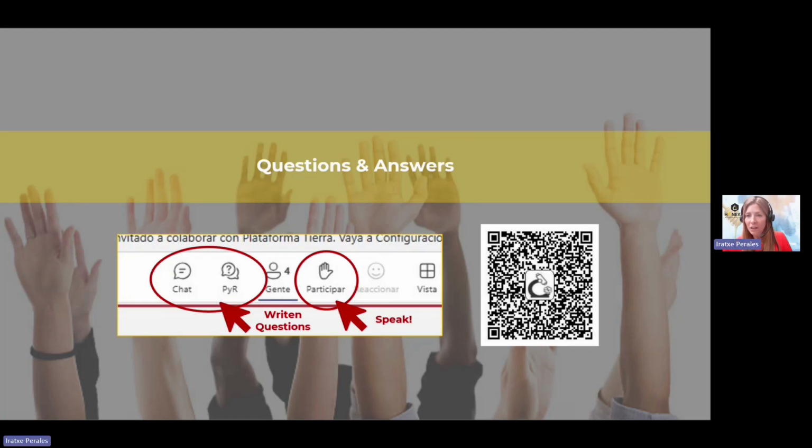Okay. Is it possible to use the system to determine whether pollen grains were artificially added to the honey sample? This is a very important question. We have been analyzing for 1 year whether this is possible. We created artificial syrups, or we used acacia honey that has almost nothing, and we artificially added corbicular pollen to this honey. We checked that for some pollen species, yes, there are differences.